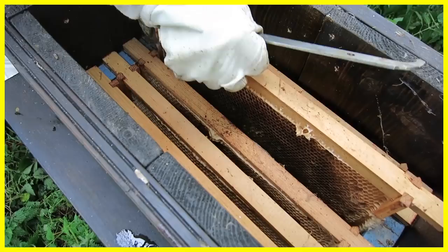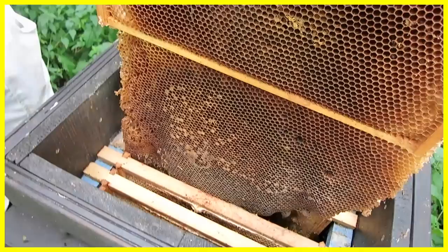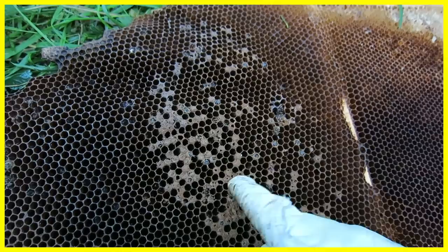When we took this wax comb out of the natural hive, the bees had long gone, so I was quite surprised that when I took a closer look inside some of these cells, they still had things inside them. It seems some bees that hadn't quite become fully grown adults were left behind, which is an amazing opportunity because we can use my special microscope camera to look closely inside these cells and see the different stages of the life cycle of a honeybee all for ourselves.